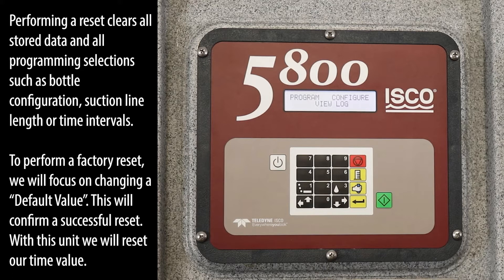To perform a factory reset, we will focus on changing a default value. This will confirm a successful reset. With this unit, we will reset our time value.